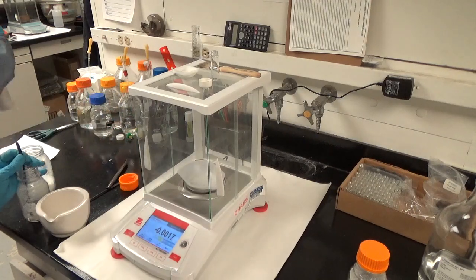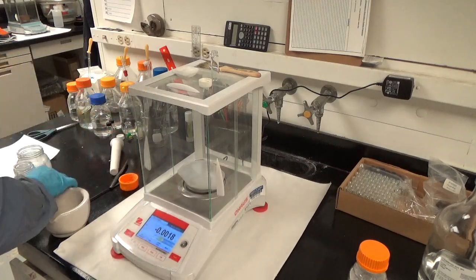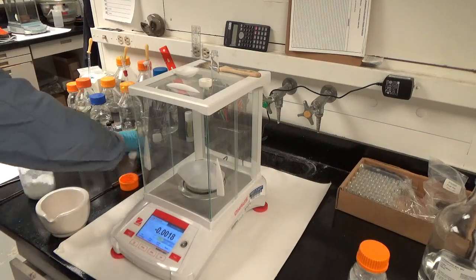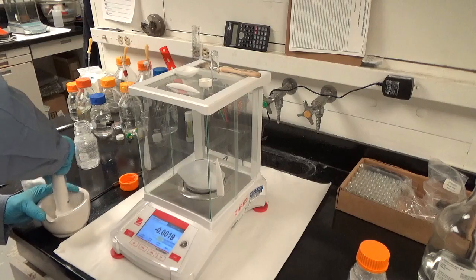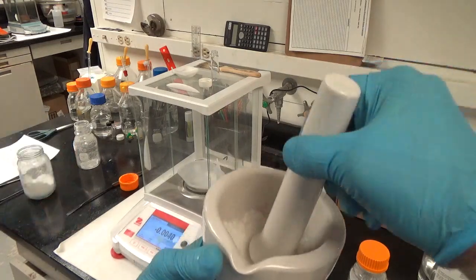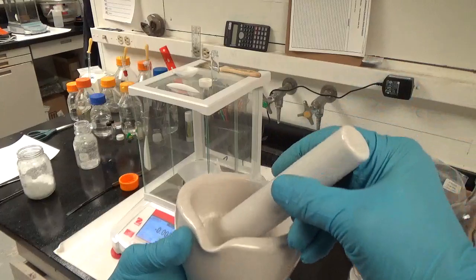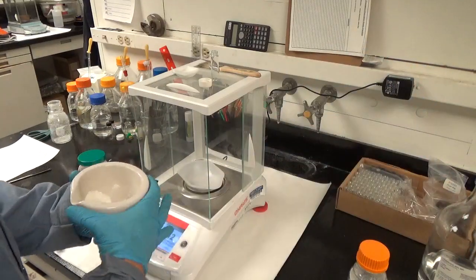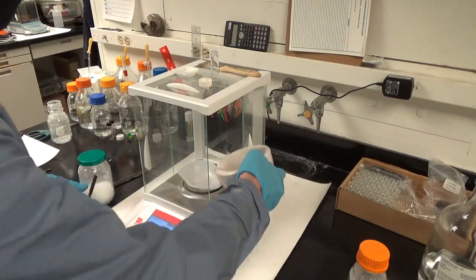Trioctyl phosphine oxide (TOPO) we actually distill ourselves, so after we distill it we pour it as a melt into these flasks. It's kind of difficult to work with - you have to break it up. It's a nice solid mass, so we have to break it up, powderize it. I believe there's about four grams.